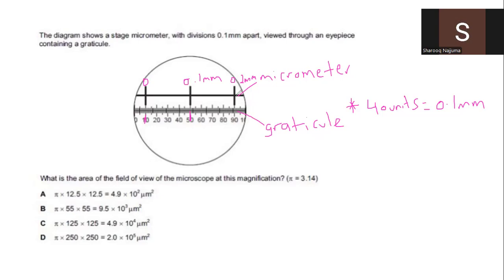Or you could be like, we have from 10. I'm counting from 10 because this region is well aligned. I might not really consider this part here. I'm going to consider this section going this side. So someone could consider from the 10th to the 90th division.